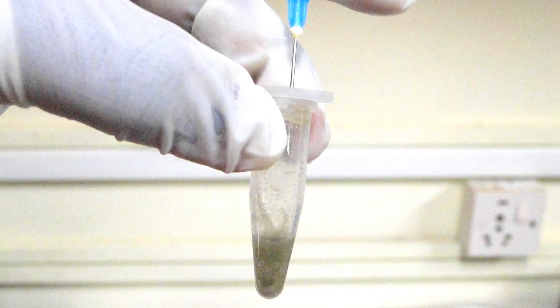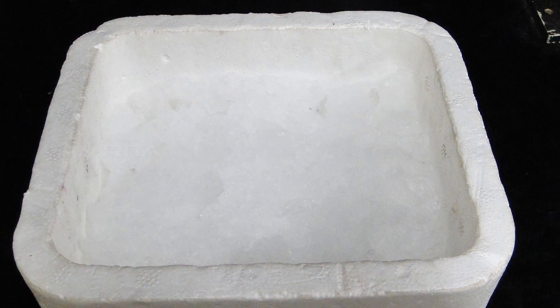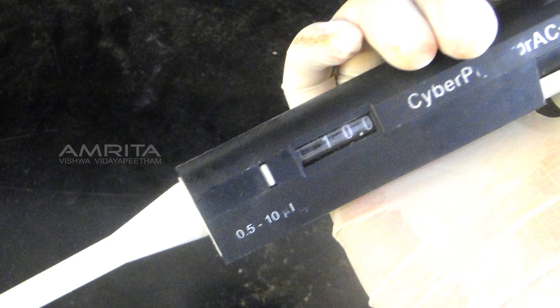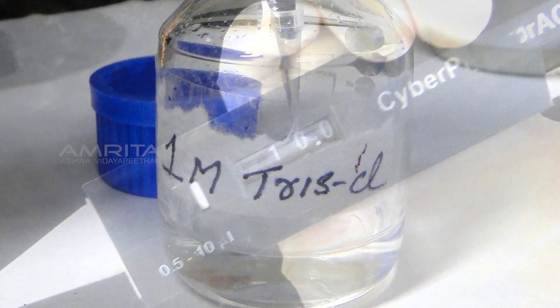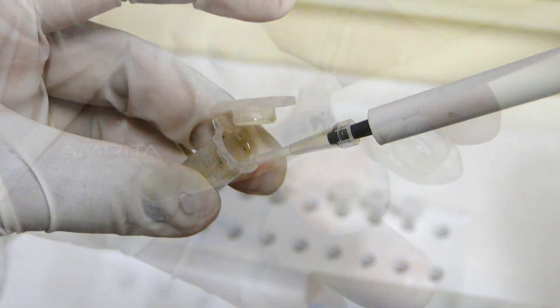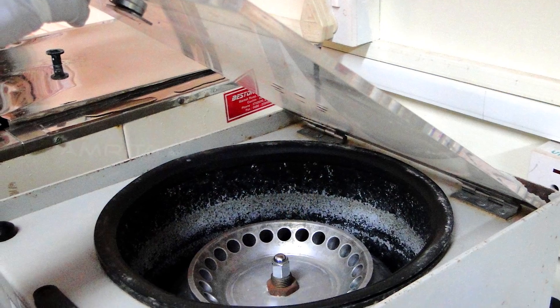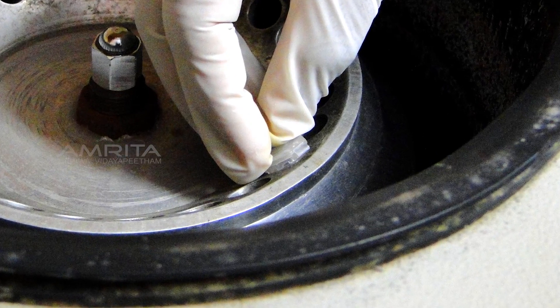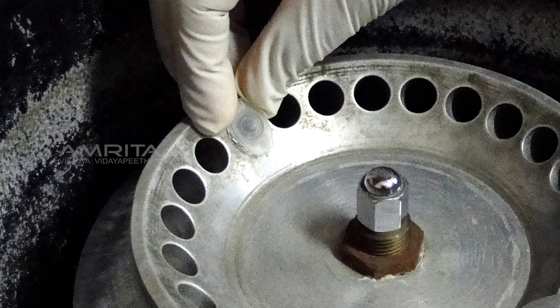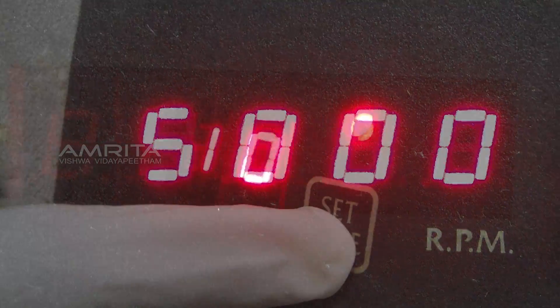Keep the vial on the floater and place it in a water bath at 95 degree Celsius for 20 minutes. Take out the vial from the water bath. Remove the syringe from the vial and keep the vial in an ice box for 5 minutes. Take a pipette, adjust it to 10 µl, and take 10 µl of 1 molar Tris HCl. Add it into the vial, mix the contents well and close the vial. Open the centrifuge and place the vial in it. Keep the vial with equal volume of water in the centrifuge for balancing, then centrifuge at 5000 rpm for 10 minutes.